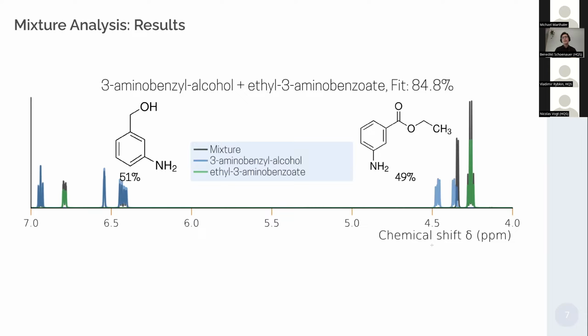and with a proper ratio. And we know that this is a 1-to-1 ratio, so our automatic workflow has recovered the proper ratio of components, whereas if I just did it by hand and looked at the spectrum, I would have been dead wrong.